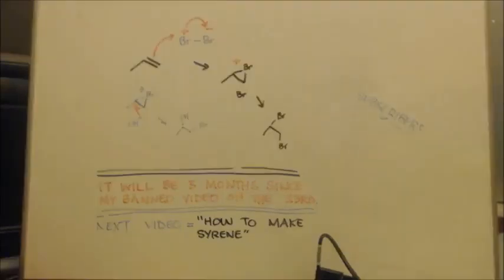That's basically it here. I'm going to show you the video. It's a short video. All I'm doing is basically putting some bromine into water.